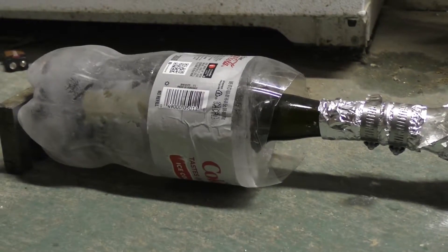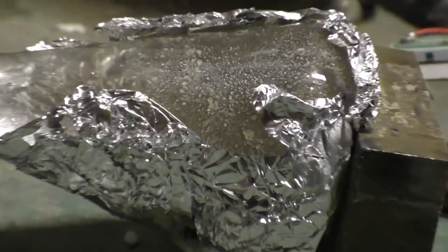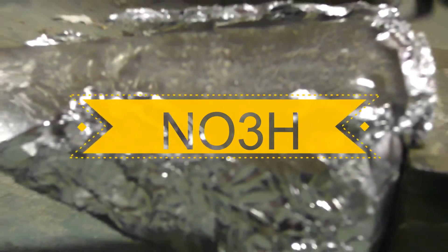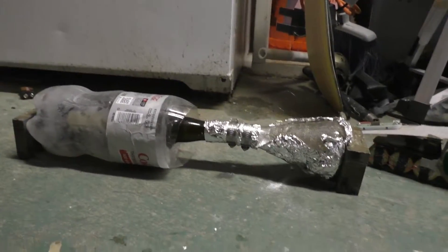Alright ladies and gentlemen, we're going to be making some nitric acid — a highly corrosive acid known for its ability to corrode copper unlike most other acids. It's synthesized with some sulfuric acid and potassium nitrate. I'll elaborate further on the chemical reaction later in the video. Let's see what happens.